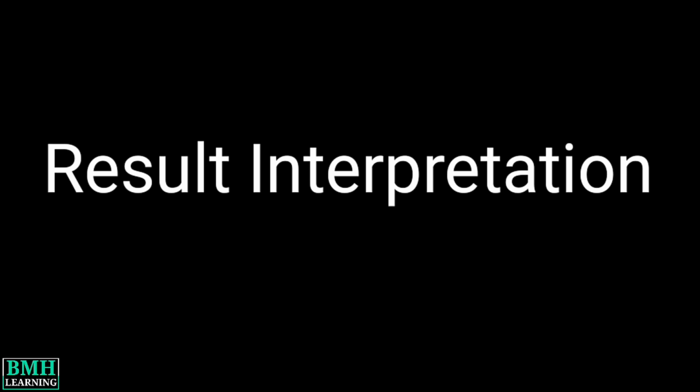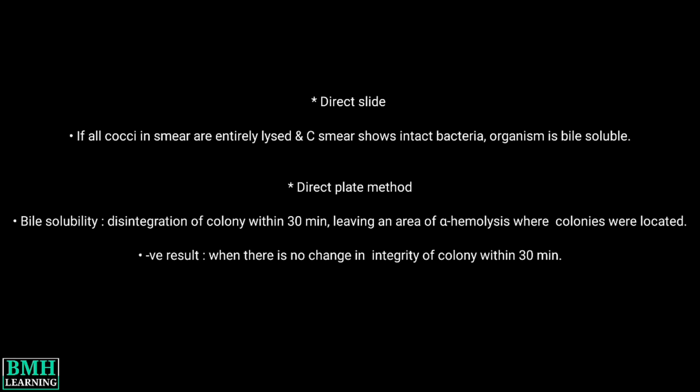Result interpretation. Direct slide blood culture method. If all the cocci in the smear are entirely lysed and the control smear shows intact bacteria, the organism is bile soluble.